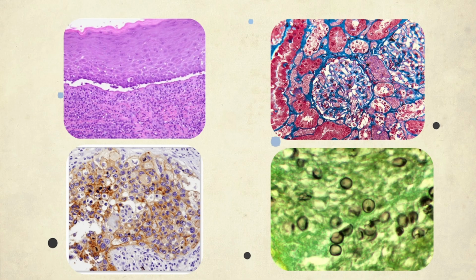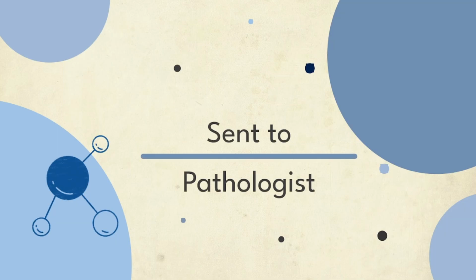In the top slide, we see that very same tongue biopsy that I showed before, which is a beautiful example of that hematoxylin and eosin stain. Underneath is an example of something we'd see in an immunohistochemistry stain, and the other 2 on the right are other examples of special staining that we may do in the lab. Once stained and fixed onto the slide with resin, the slide undergoes some final quality checks and is ready to be sent to a pathologist for assessment. In this case, after Darryl's stained specimen slides were received, Darryl's pathologist diagnosed him with squamous cell carcinoma of the tongue.